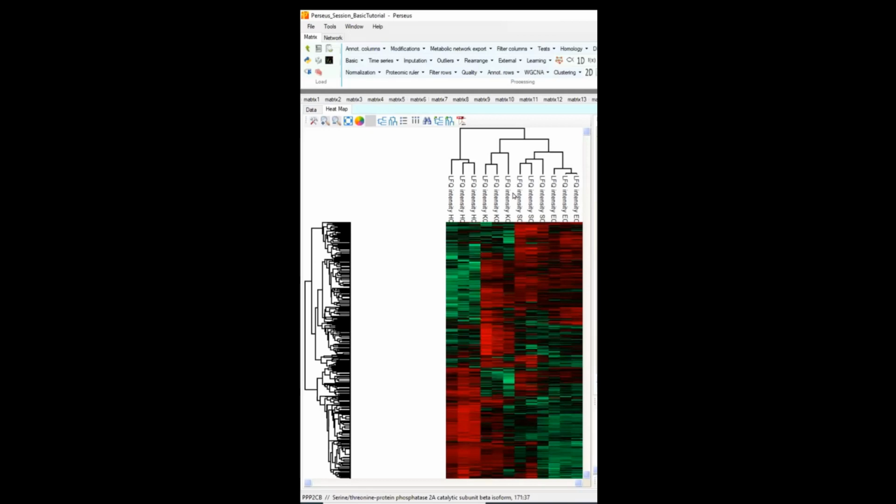But if the algorithm was not merging the clusters in this way, that would already be a red flag. So this is yet another way to see if there is something real in your data. Let's say if it was clustering these two together, then that would be weird. Okay, and at the protein level, you have many clusters. So this is more difficult to interpret.